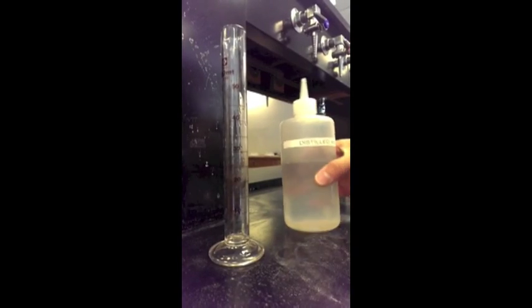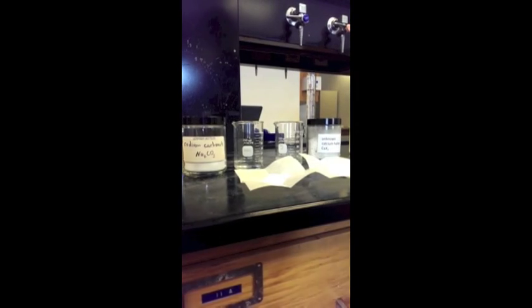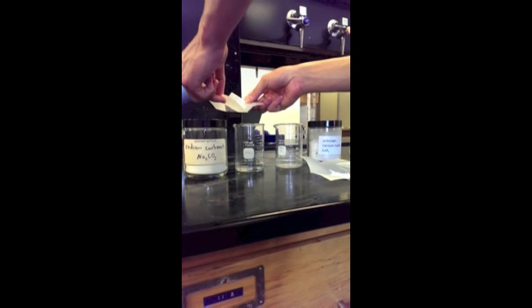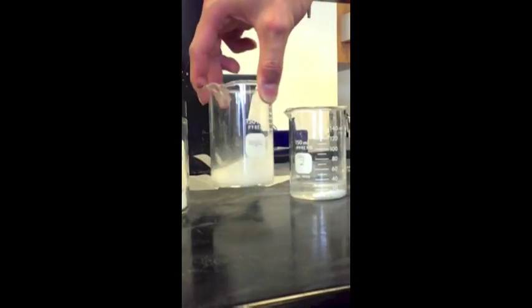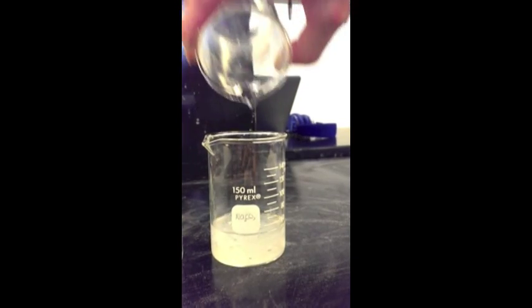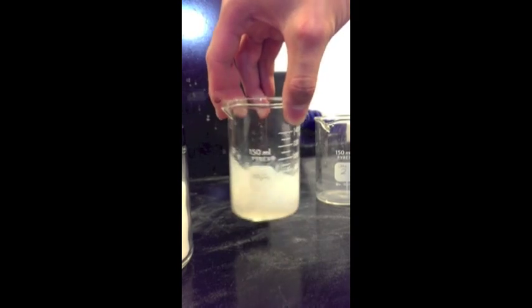Measure out 20 milliliters of distilled water and pour it into each of the two 150 milliliter beakers. Pour the sodium carbonate and the calcium halide into each of the respective beakers and swirl until both are fully dissolved. Next, once both of the solutions are fully dissolved, combine the contents of both beakers. Swirl until a precipitate is formed.